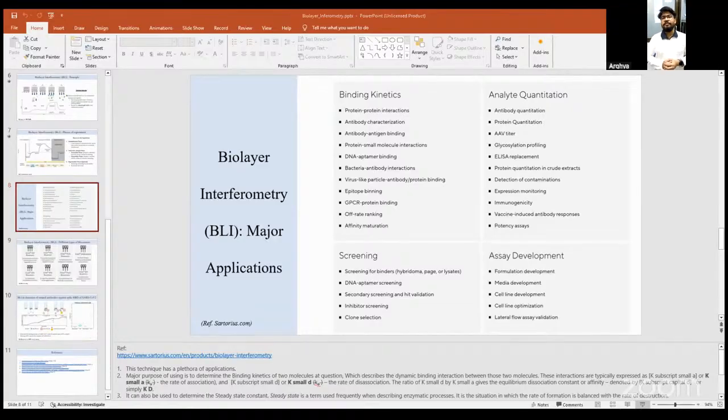So to conclude, this instrument, just like SPR, can also do different kinds of interaction studies, be that antibody-antigen, drug-protein, or any kind of molecule studies. One can be bound to the ligand, one can be the analyte. So that's how versatile this instrument and technology is.